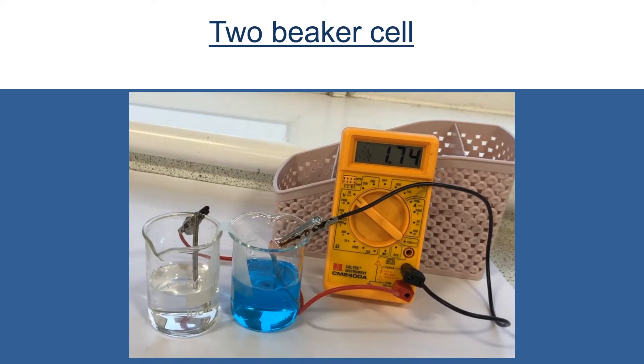On the right hand side beaker we've got copper sulfate solution, that's the blue one, with a piece of copper metal and again connected to our multimeter. We're recording the voltage produced in this cell.